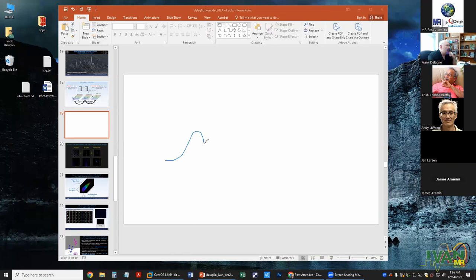The way SMILE works is it identifies a maximum and checks how wide the peak is, and then goes through its list of models and finds a model that matches that line width. Okay. And that's what it uses as a synthetic signal. But you can imagine that if there are two peaks that overlap, it's first going to try to make an estimate for this peak. And because the peaks overlap, the true line width and height of this peak is different from the apparent line width when you look at these peaks in overlap. So in this case, it's going to make a model for the biggest peak, but that model isn't perfect.